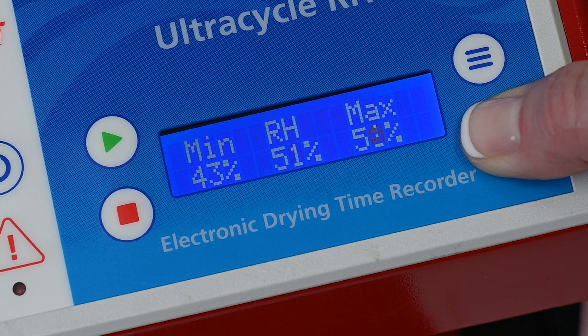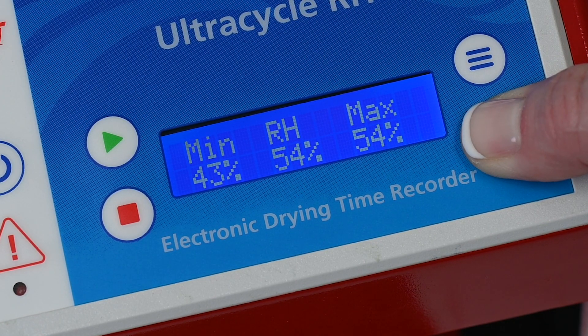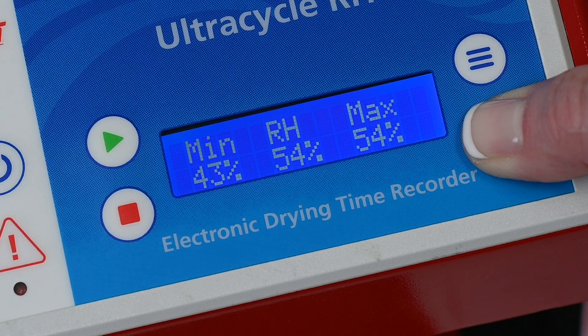The UltraCycle also records the temperature and humidity of the surrounding area during the test to help determine accuracy in unstable conditions.